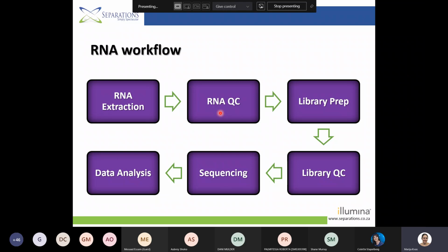How degraded it is. And when we're talking about RNA experiments, we're talking about what we call a RIN value, RNA integrity number, and there we want it to be anything above 8. I'm talking here about obviously mammalian RNA. It might differ for different species, but like I mentioned, we're going to focus on human today, mammalian hosts, right? So that integrity of RNA is really important.